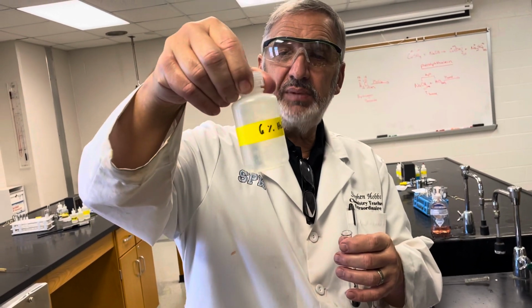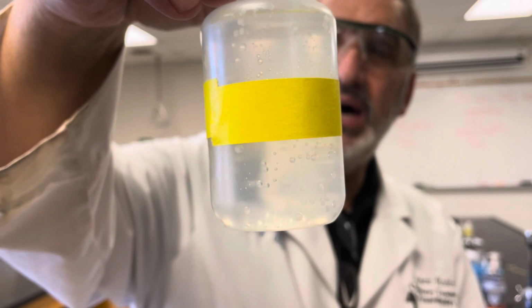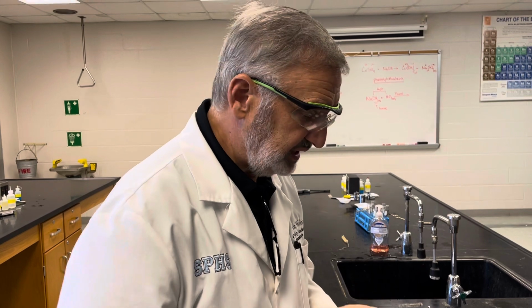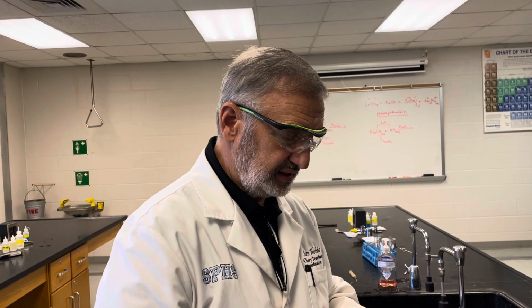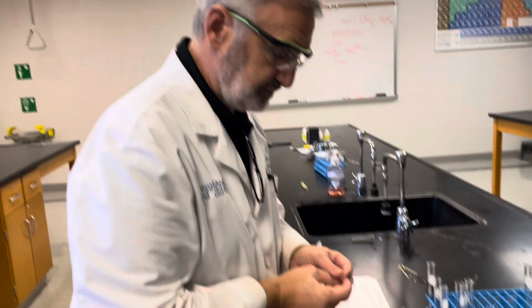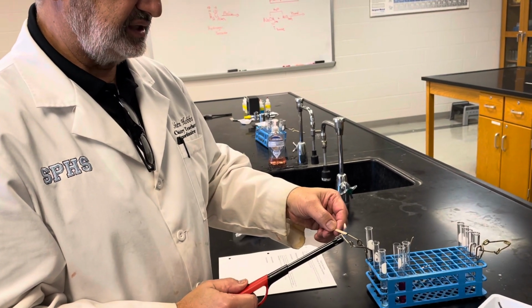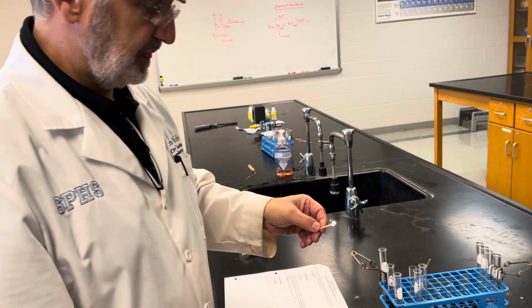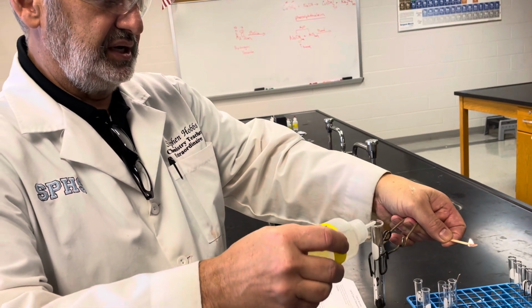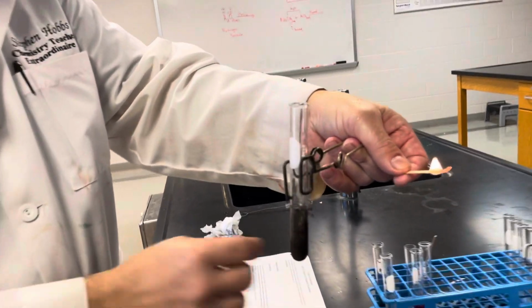And we can even look at this bottle, and you can see that there are little tiny bubbles on the inside of this bottle already just sitting out, because hydrogen peroxide decomposes all on its own. Now again, we never ever hold a test tube in our hand, okay? And we want to have another splint on fire, ready to go here. So I have the splint on fire, and I'm just going to take some peroxide and pour it into the test tube. And immediately you can see it bubbling in here.